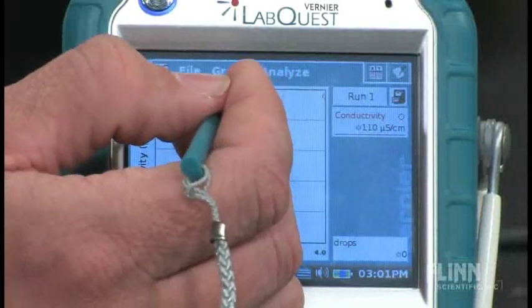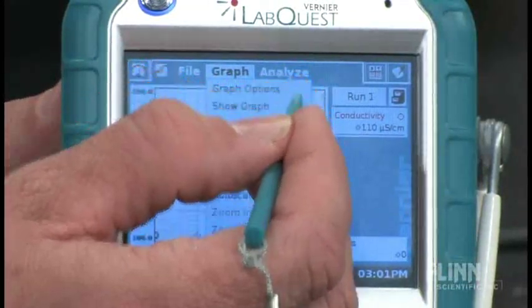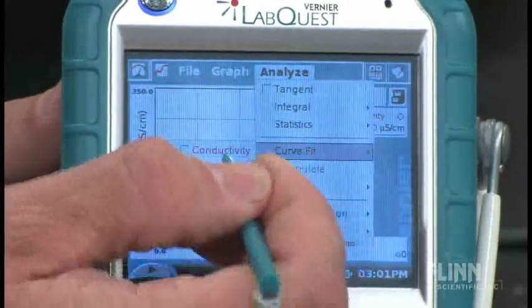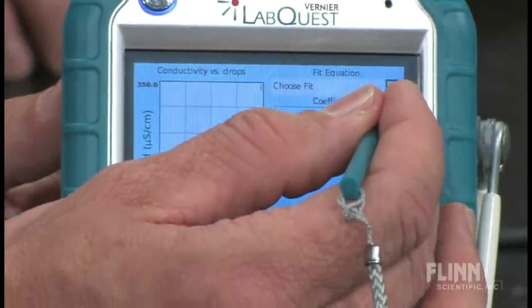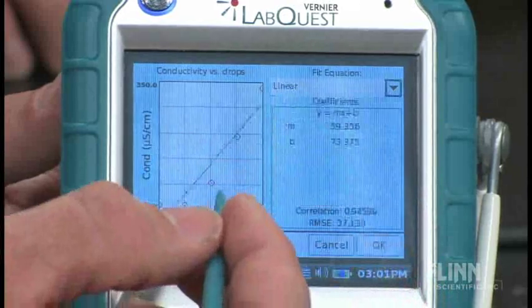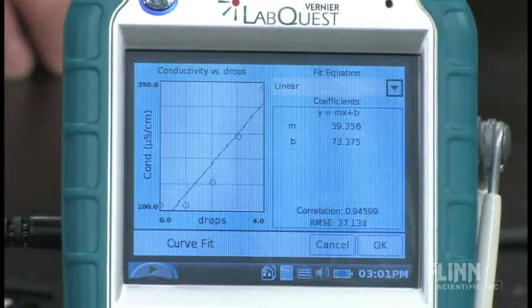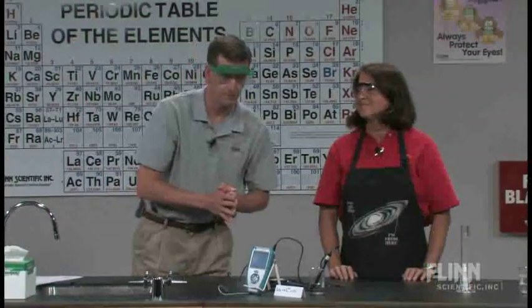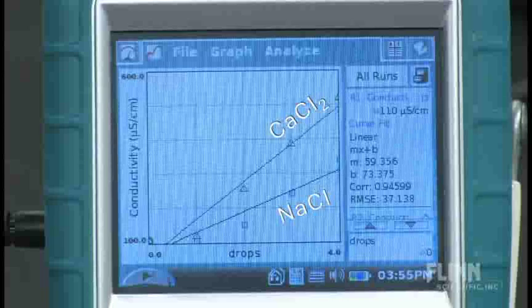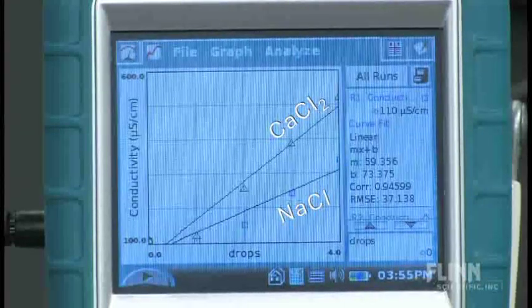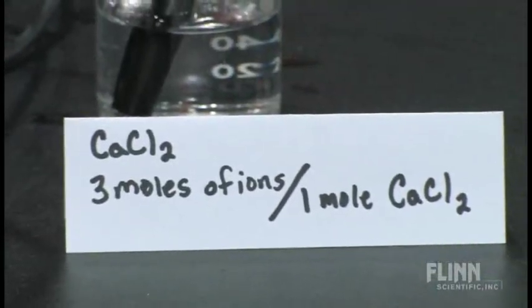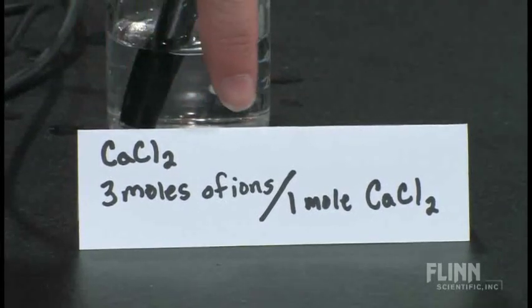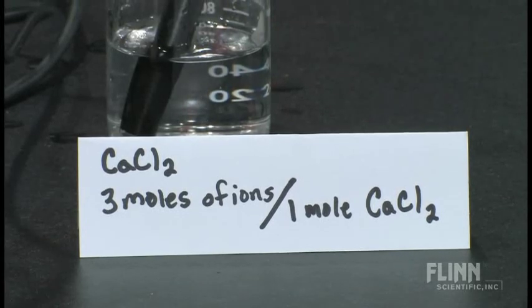And we then stop this. I go to my graph. Analyze. I want a curve fit on the conductivity. The type of line I want is linear. And we get a nice line on that from which we could have statistics and it would put a nice slope on that. The reason that we are going to get more of a slope on the calcium chloride as opposed to the sodium chloride, if we take a look, with the calcium chloride, we get three moles of ions produced with each one mole of calcium chloride. That gives us greater slopes.